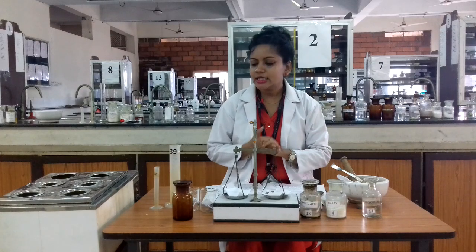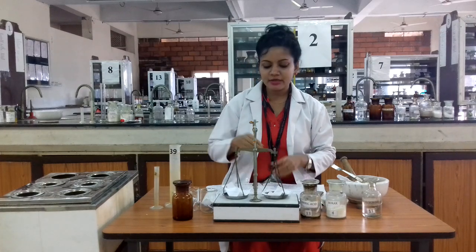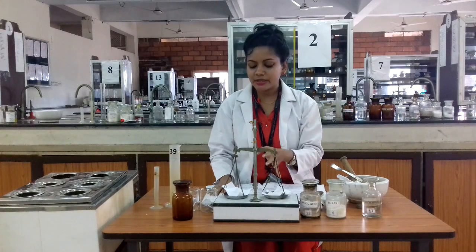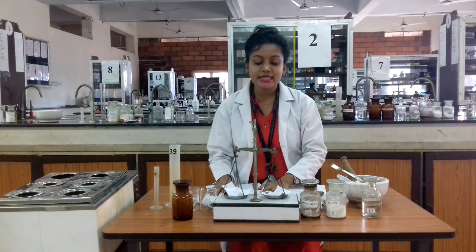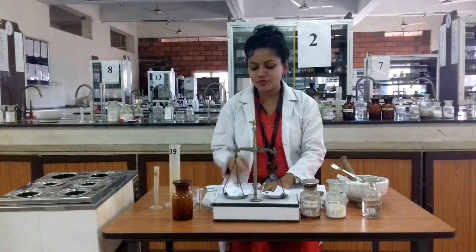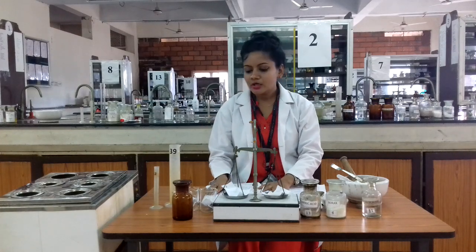So here I am going to prepare the gum pain for 20 ml. In your exam, if it is asking you to dispense 20 ml of tannic acid glycerin paint — a paint that is suitable for bleeding gums — this is how you proceed.